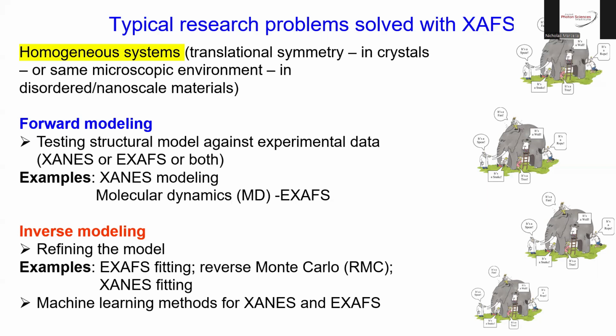A better way to do it is inverse modeling. What's inverse modeling? You start from the spectrum, you go to the structure, and it gives you presumably a unique objective answer, if you like. There are, of course, subtleties. You can go in the false minimum direction, but it's all nuances. But that's the conceptual difference between forward modeling and inverse modeling.